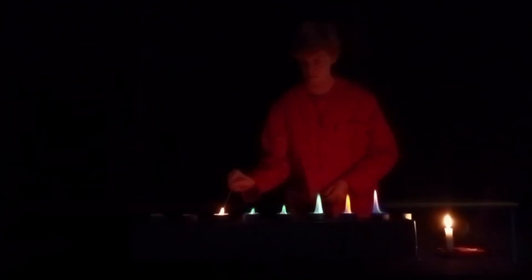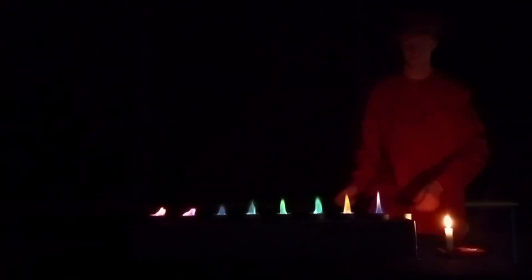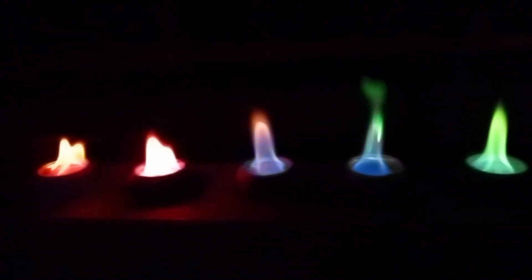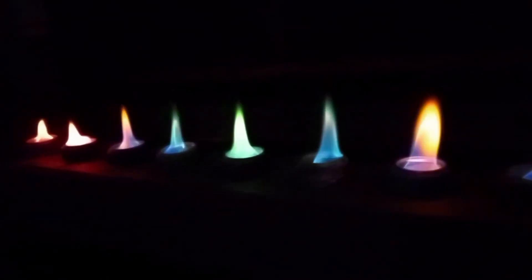This is because when heated, the metal ions gain energy and their atoms become excited. This excitement is short-lived and the excess energy is released again. This energy is released in the form of light of a certain wavelength, which is indicated by the colour we observe.